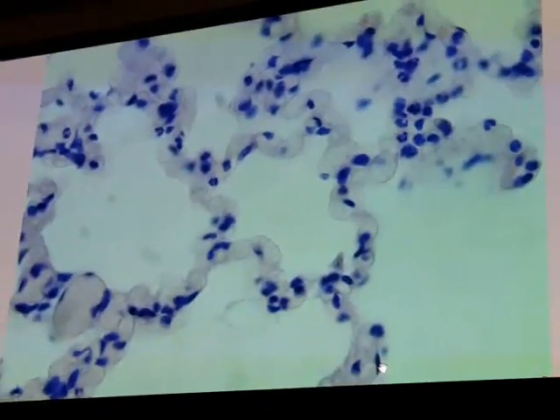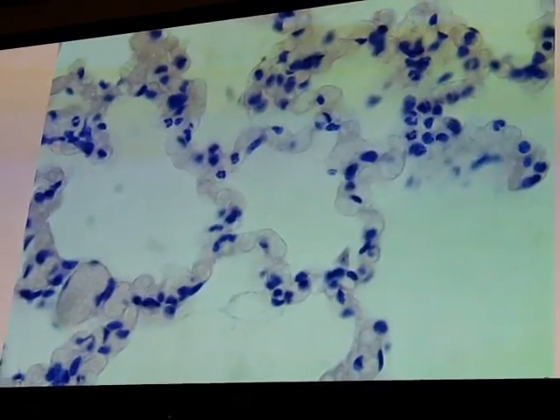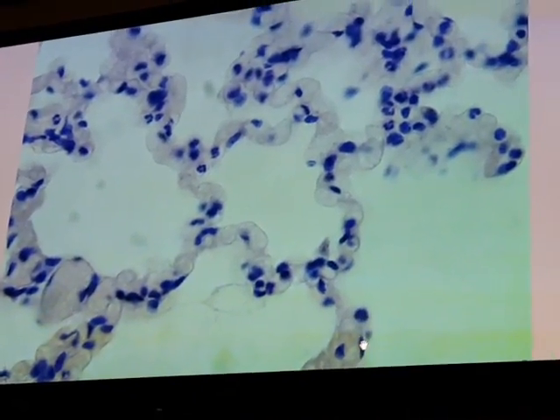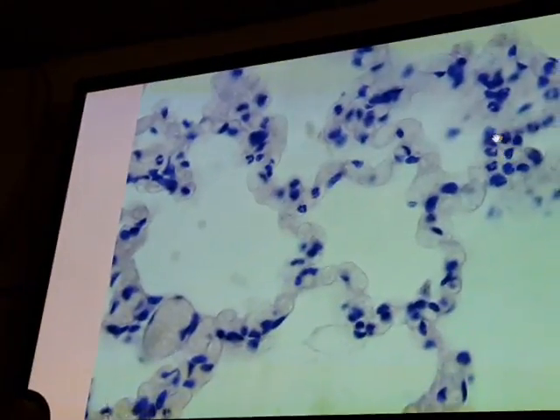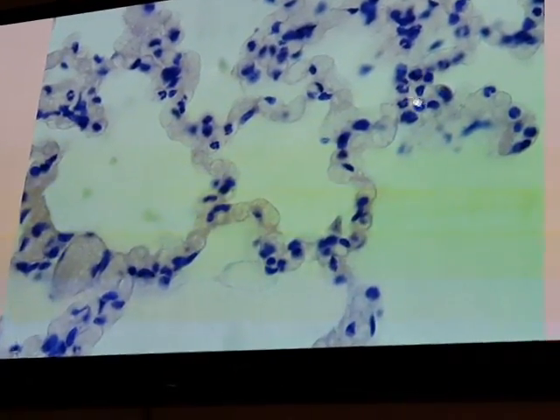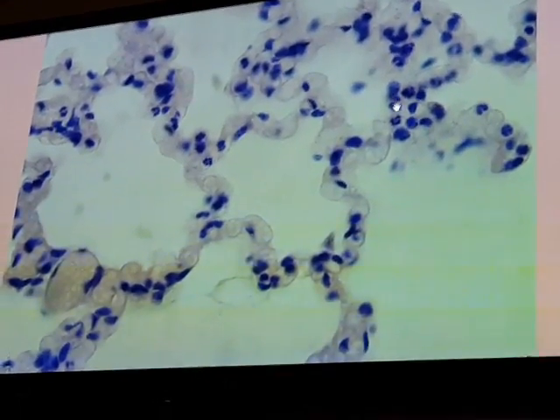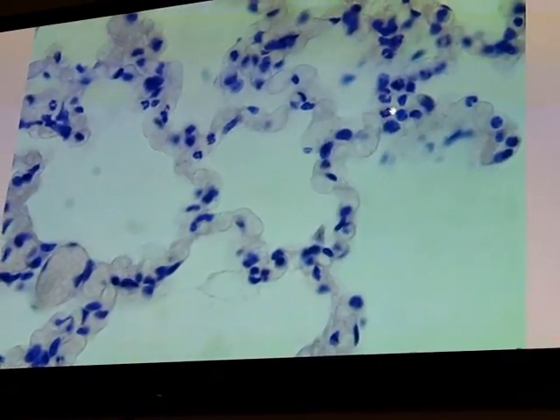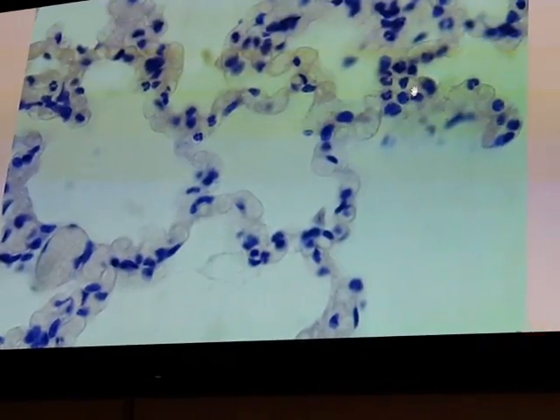Okay, clear? Type 1, you will see, is elongated, flattened. This is the nuclei of type 1 alveolar cell. Type 1 or squamous alveolar cell. While type 2 cells are found in groups at the angles between interalveolar walls, meaning they are usually found in the corners, in groups. Their shape is rounded with vesicular cytoplasm or foamy cytoplasm. This is type 2.